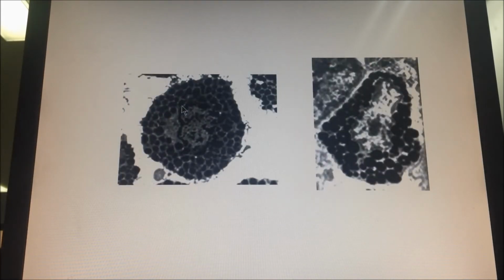Another cell in the connective tissue وانا تيجي تطلع بتشوف a very large rounded cell. The nucleus هون small rounded وcentral. لحد الآن ما شفناش ولا أي nucleus rounded وcentral. والcytoplasm is filled with electron dense granules. This cell is the mast cell. This is the mast cell.